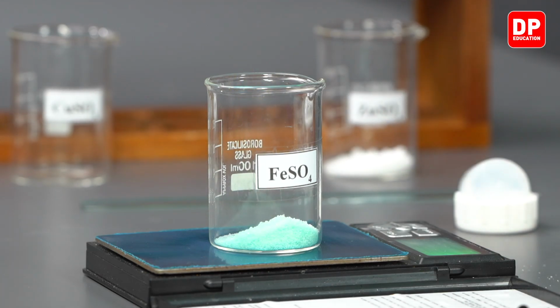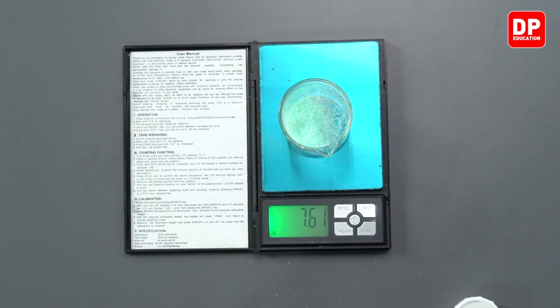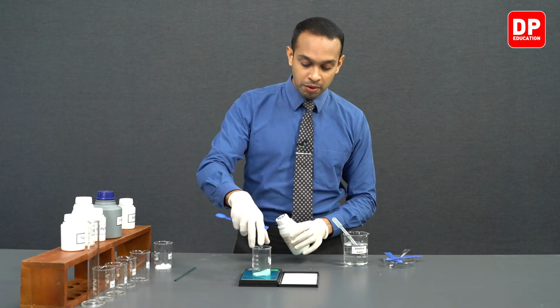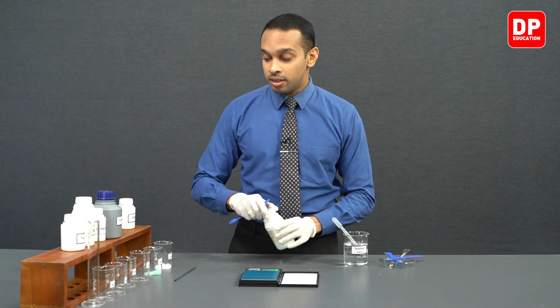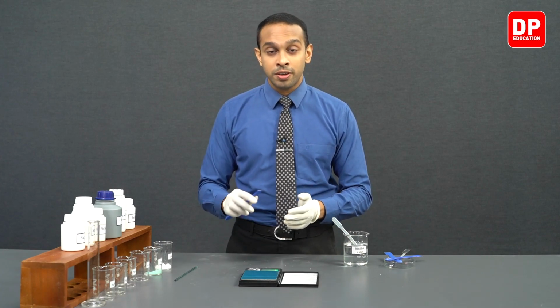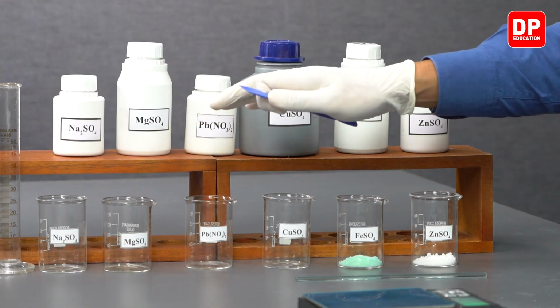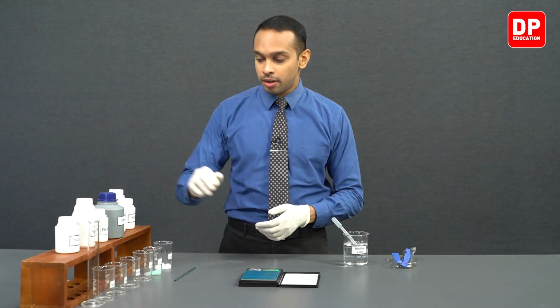We need 7.6, we need a little bit more. We have measured 7.61 of ferrous sulfate. Now, before adding water, we will leave it aside. So keep in mind, we are going to measure the relevant masses of each of these solids first, and then after we have measured all of the masses, we will add 50 milliliters of water to each of these beakers we have over here, and then we'll prepare the solutions. And then, students, we move on to copper sulfate.